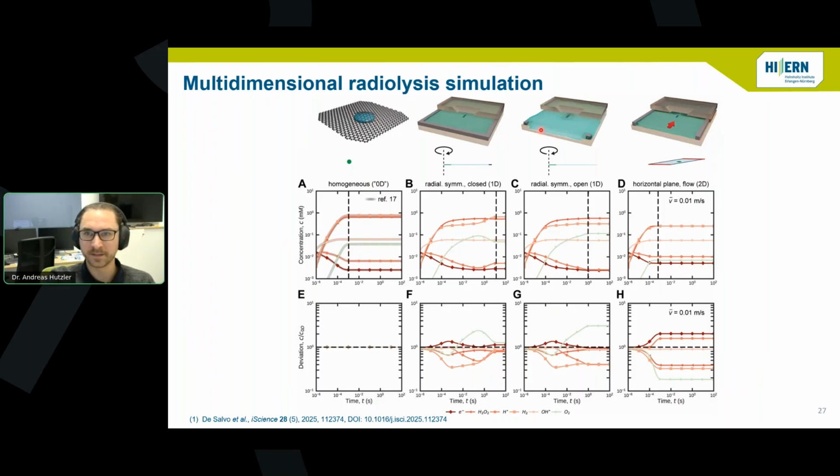And then when looking at certain different cases, so a larger volume of liquid and you just irradiate a tiny amount of that in a closed configuration or open configuration or even under flow conditions, it turned out that for a first rough approximation, you can even apply a 0D model and you hit, let's say, the result within one order of magnitude.